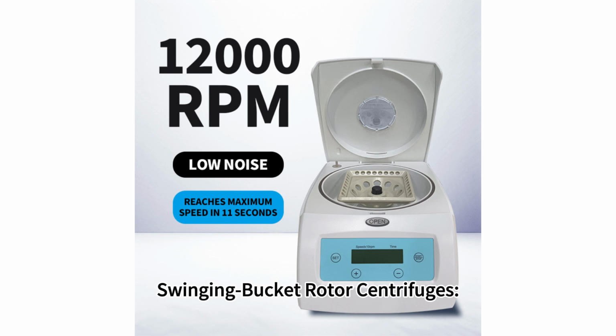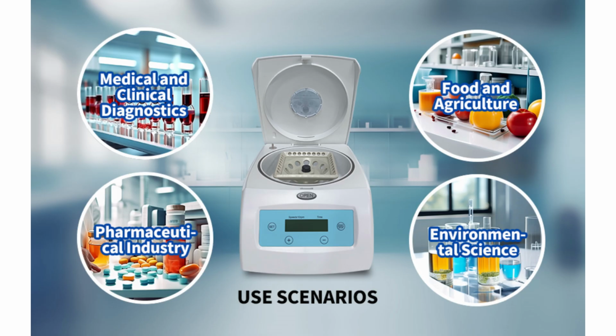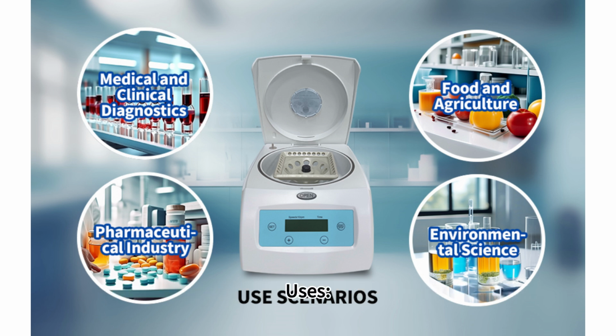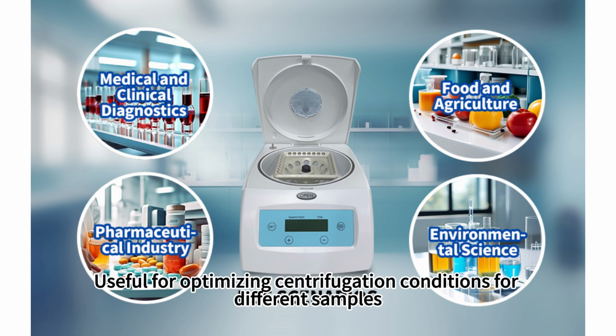Swinging bucket rotor centrifuges. Description: buckets swing out perpendicular to the axis of rotation. Uses: suitable for gentle handling of samples, such as blood fractionation. Variable angle rotor centrifuges. Description: offer adjustable angles for the rotor. Uses: useful for optimizing centrifugation conditions for different samples.